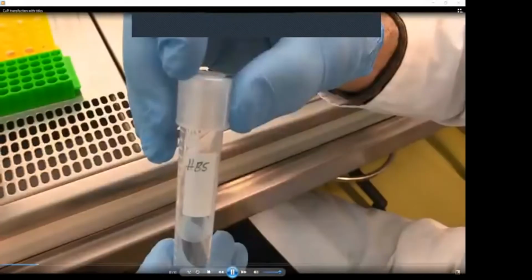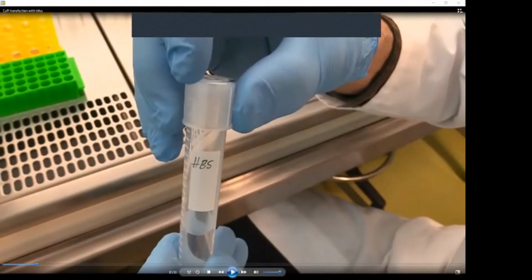Next thing which you see in the very first moment is the color of the media. And now we are coming to the transfection. So what do you need for the transfection? The easiest and cheapest technique is called calcium phosphate transfection. The disadvantage of this technique is very low efficiency. This depends on the cell type naturally. With some cell types it's very good and the efficiency is sufficient. With these particular MEFs, it's not so good.